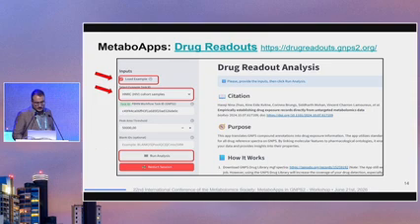So here it is going to show a task ID for the example that we've made for this data set, but you can just type any other task ID from another job that you've performed before. One of the things that is different in this one than the other ones is that, as we're talking about exposure, you need to have at least an idea of the threshold you'd like to select for these exposure records. You can change that later, but this is just for the initial visualization of the tool.